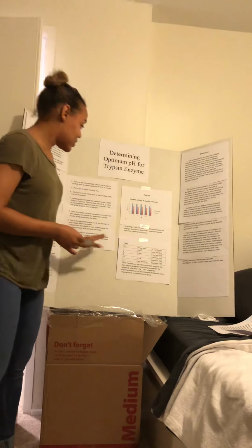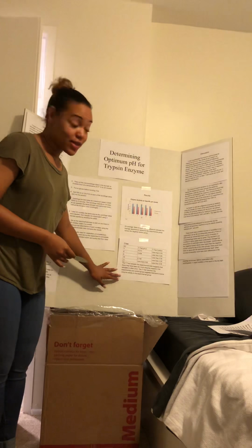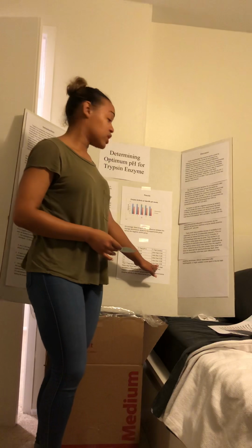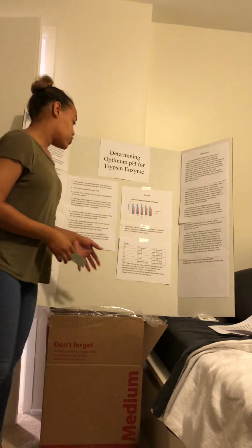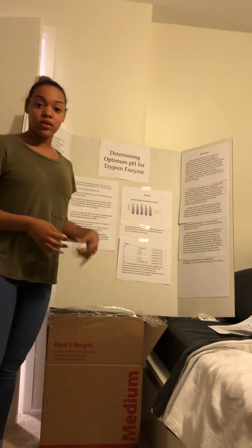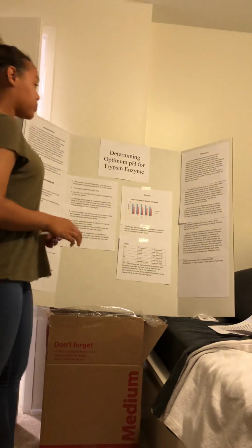Our t-test down here was not as helpful as we wanted it to be. This is for our control versus the experimental. It's less than 0.05, meaning that the enzyme did have an effect on the catalyzing of the reaction. However, the t-test compared within the experimental group shows that there might have been too much enzyme in each solution to clearly test if there was going to be an optimum.